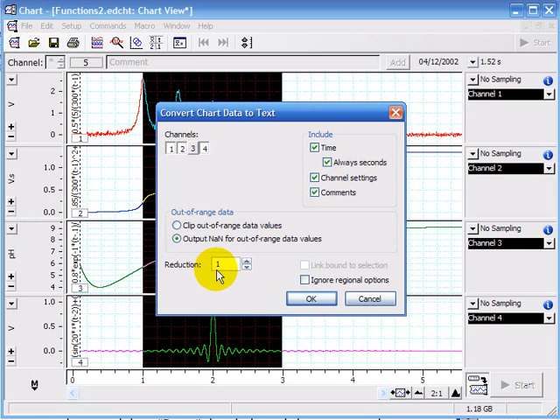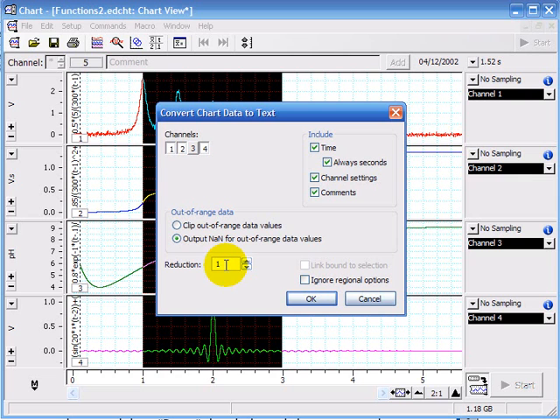This reduction, if you've got too many data points, you can reduce that. If you click 10, it will copy every tenth data point.